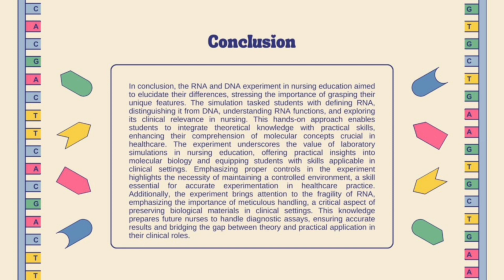This involves maintaining the stability of the gRNAs by storing them in a freezer or on ice during the DNA cleavage assay design. Acknowledging the chemical fragility of RNA in comparison to DNA, the data generated from this simulation will serve a critical purpose, determining the volume of reagents required for optimal results. As RNA is chemically less stable, understanding the impact of temperature on its integrity becomes crucial for the success of the experiment. By utilizing the gathered data, students can fine-tune the experimental conditions, ensuring accurate measurements and reliable outcomes.